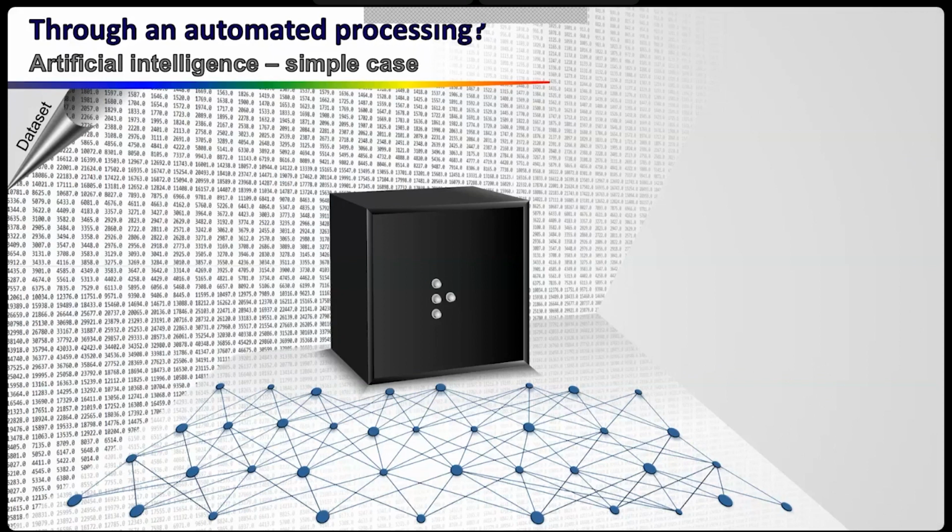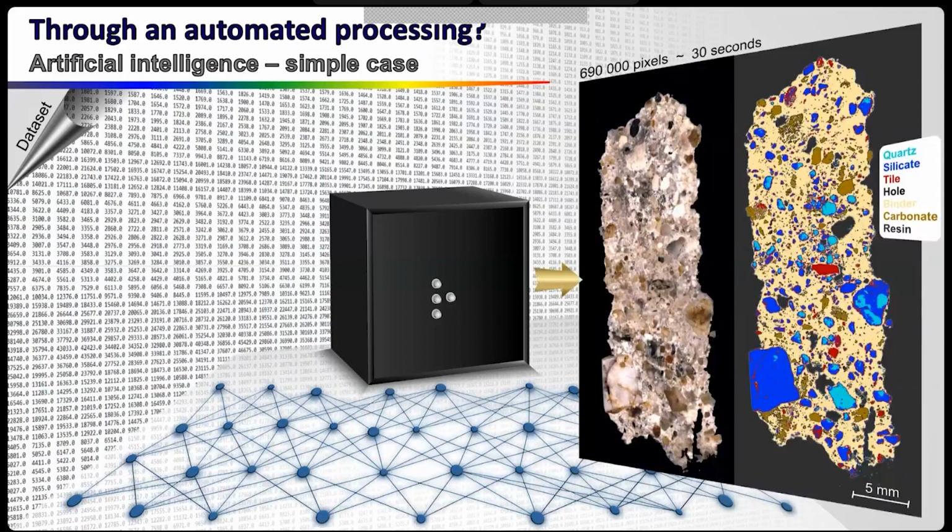And then we close the algorithm, and the magic occurs, honestly, because you send only numbers to your algorithm, and the output is an image. And you have here a direct analysis of this sample, where you can see all the silicate, quartz, carbonates, and so on. That is really close to the reality. So these results were managed by an expert in archaeology, and he was very enthusiastic.